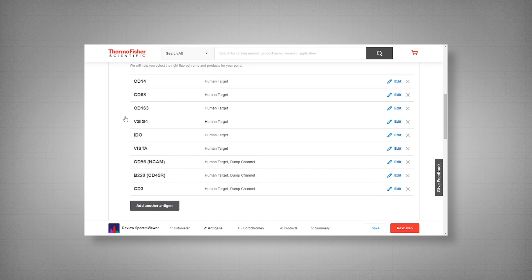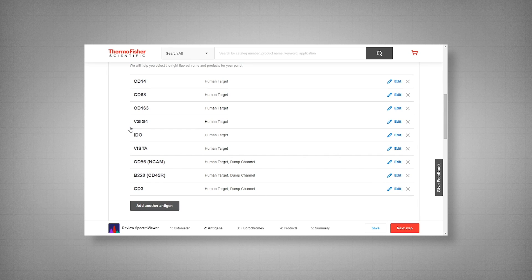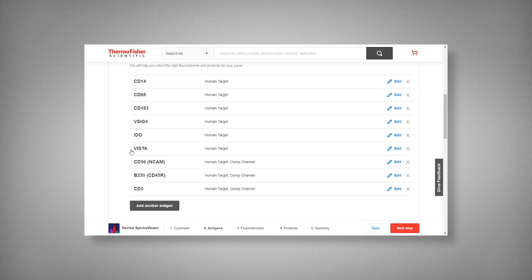And next up we have our functional markers. CD163, which is a scavenger receptor expressed on the cell surface of monocytes and macrophages. We have VSIG4, which is expressed on tumor infiltrating macrophages. IDO is one of our intracellularly stained targets. And VISTA, otherwise known as B7H5.